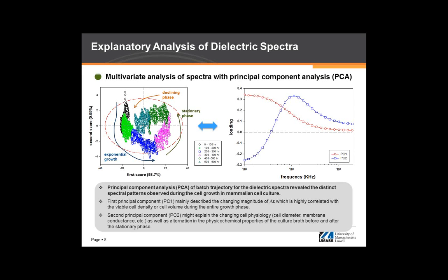So even if you measure the dielectric spectroscopy value at specific frequencies, that may not capture all the information about the physical phenomena that you are having.